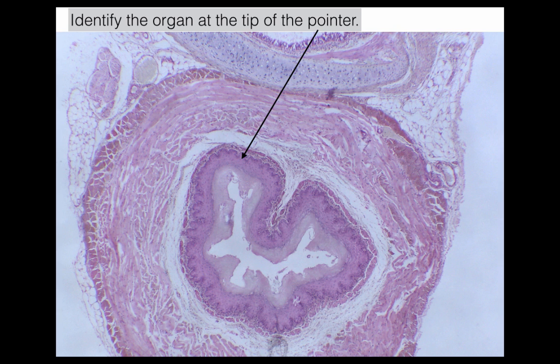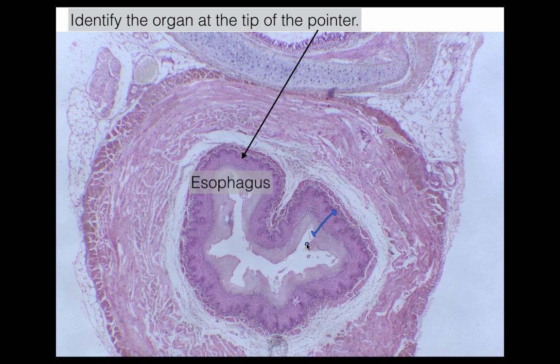You should have said esophagus. The reason we know that is we can see this stratified squamous epithelial tissue here — that's really the only slide in this unit that has stratified squamous, so you should be able to easily identify that. Another identifier is going to be the patchy muscularis mucosa, which you can see here.